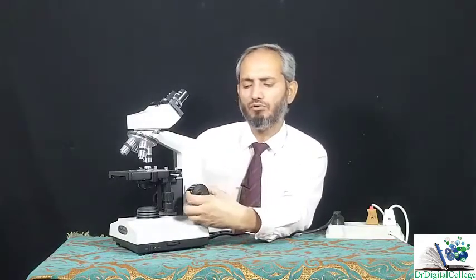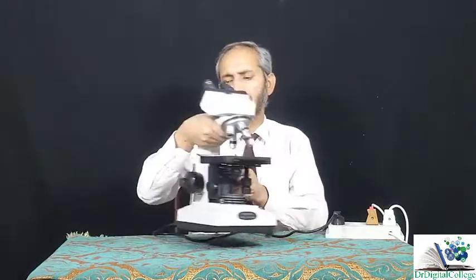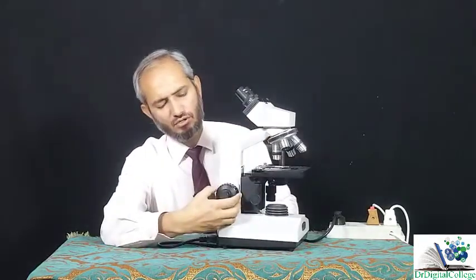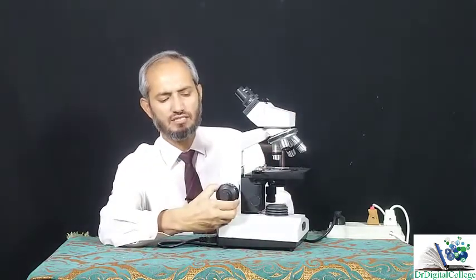While you move one knob on one side, it will be moving on both sides. Look at this, there is a knob on both sides. So you can use your right hand or your left hand for the movement of this knob.